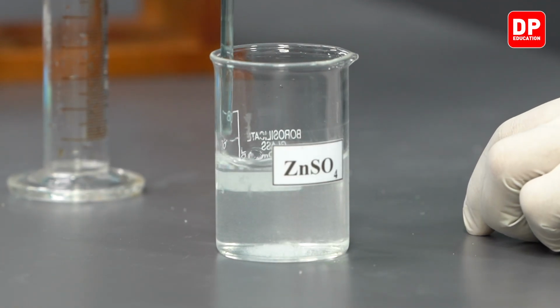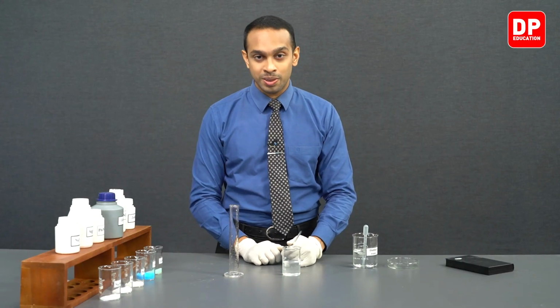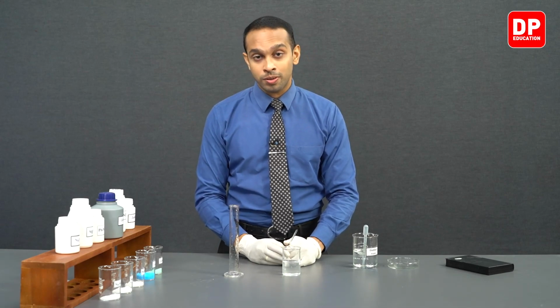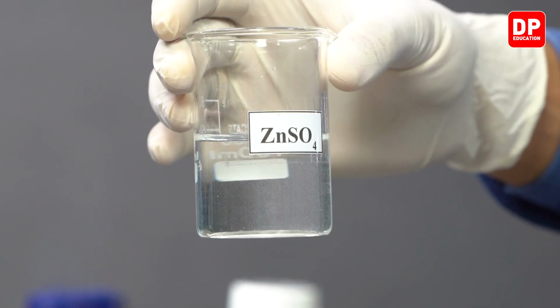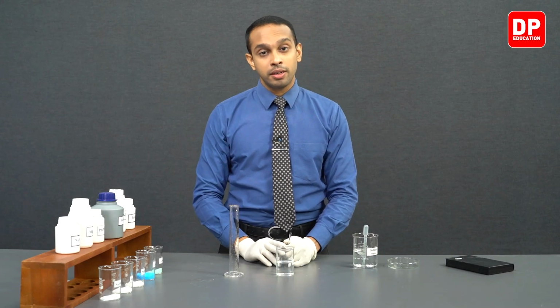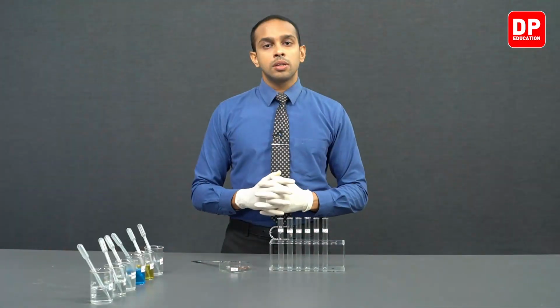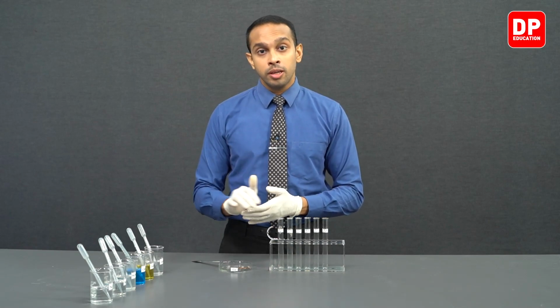Now students, this is how we are going to prepare all of these other solutions as well. So since this is a repetitive process, we will be preparing the rest of the solutions off camera. And students, after preparing the solutions like this, you can see we have dissolved all the solid and prepared our zinc sulfate solution. After preparing each of these solutions like this, we will take those solutions and bring them to the next part of our experiment.